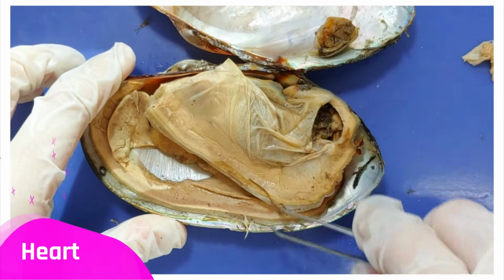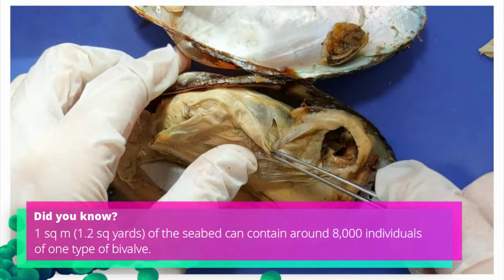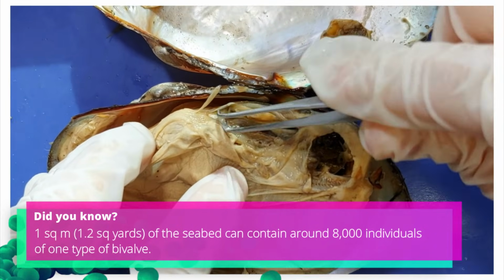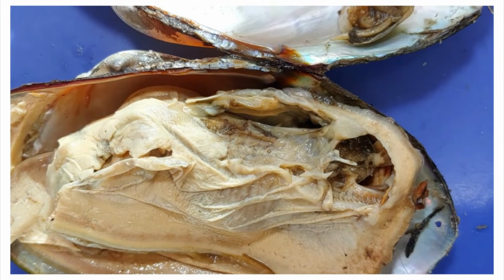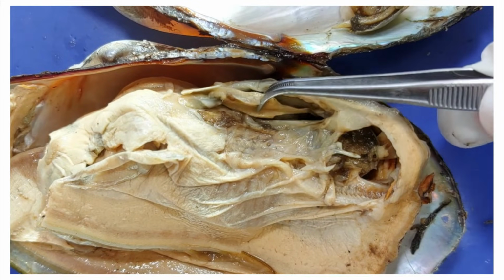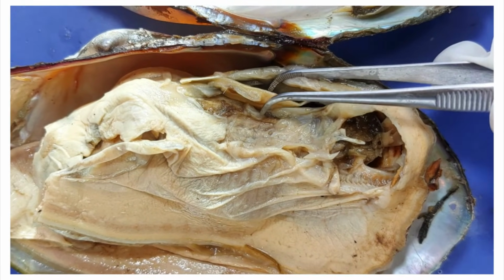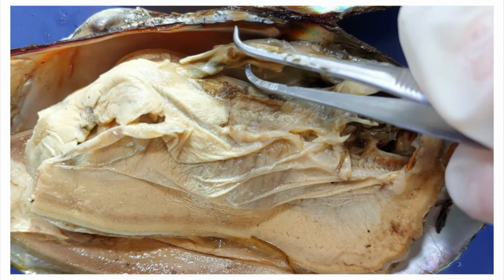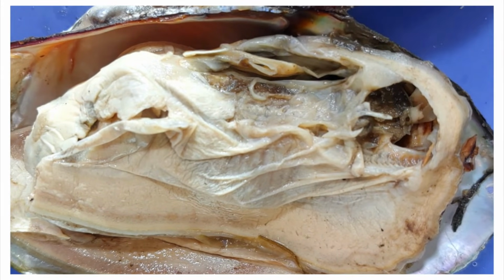Now, way up by the hinge is the heart. I'm going to try to dig it out. The clam has an open circulatory system, unlike us humans, who have a closed circulatory system. An open circulatory system is a bit like a jacuzzi. The body cavity is filled with a fluid called hemolymph that sloshes around the internal organs, helped along by the pumping of the heart. Now, if we pull this out, you might be able to see that there are holes in the heart. Here and here. This is also characteristic of an open circulatory system.